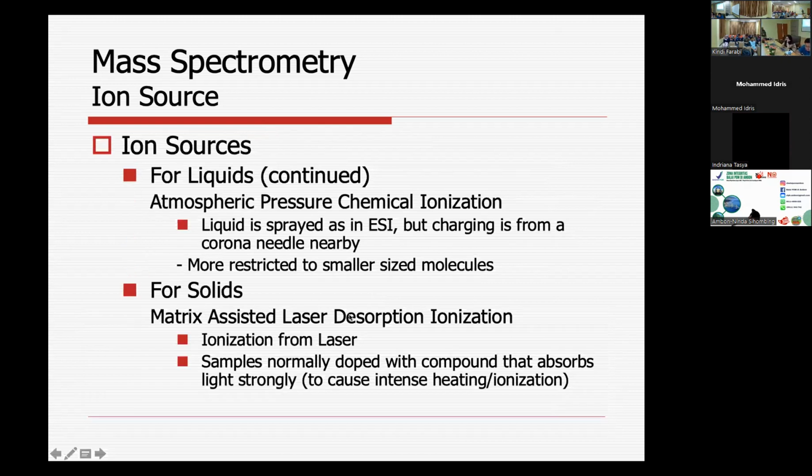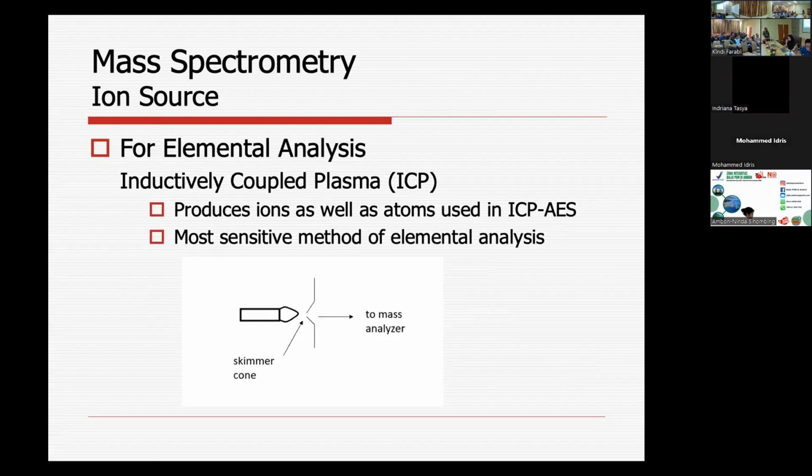Nah, kalau kita lihat ion source dalam bentuk liquid, tadi juga sudah dijelaskan. Kalau solid, ini yang kita sebut dengan MALDI tadi, matrix assisted laser desorption ionisasi. Jadi ionisasi dari suatu laser. Sampel diletakkan dalam suatu senyawa matriks dan mengabsorpsi sinar yang sangat kuat yang menyebabkan terjadinya ionisasi.